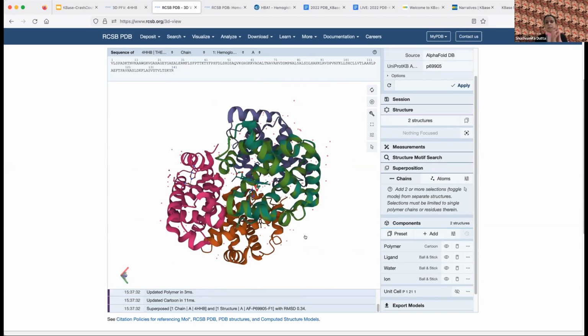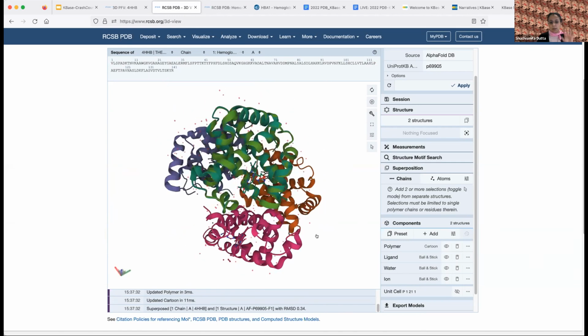Anyway, this idea came up in one of the questions someone had posted in the Google Doc. When we are looking at these models, they are modeling pretty much the whole sequence, including any signal peptides or residues that are removed after the protein has been expressed, which may or may not coincide with what the expressed protein's experimental structure shows you. So we should be mindful of these little details, because that may have implications for where the functional sites are and how the ligands interact.